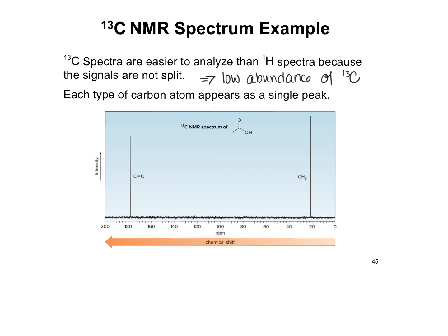So this is an example of a spectrum where we have two peaks, right? Because there's a carbon here and a carbon here. And one of the things that's also really nice is that the shielding that we learned about is echoed in carbon-13 spectra. So for example, the carbonyl, right, is much farther downfield than the CH3. So we can draw some parallels, which makes it very nice to analyze.